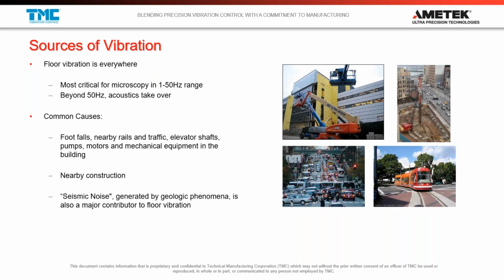All of these things are external vibration sources that can add vibration to your building and cause it to sway or bounce or vibrate or tilt or rotate. I'll talk about that later, in levels that are imperceptible to humans, but noticeable when you're talking about 5,000, 500,000, million times magnification. Nearby construction is also a very common one, where you might build a facility in a green field where there's nothing nearby, and all of a sudden your neighbor builds a building right next door to you. So there's a lot of sources.